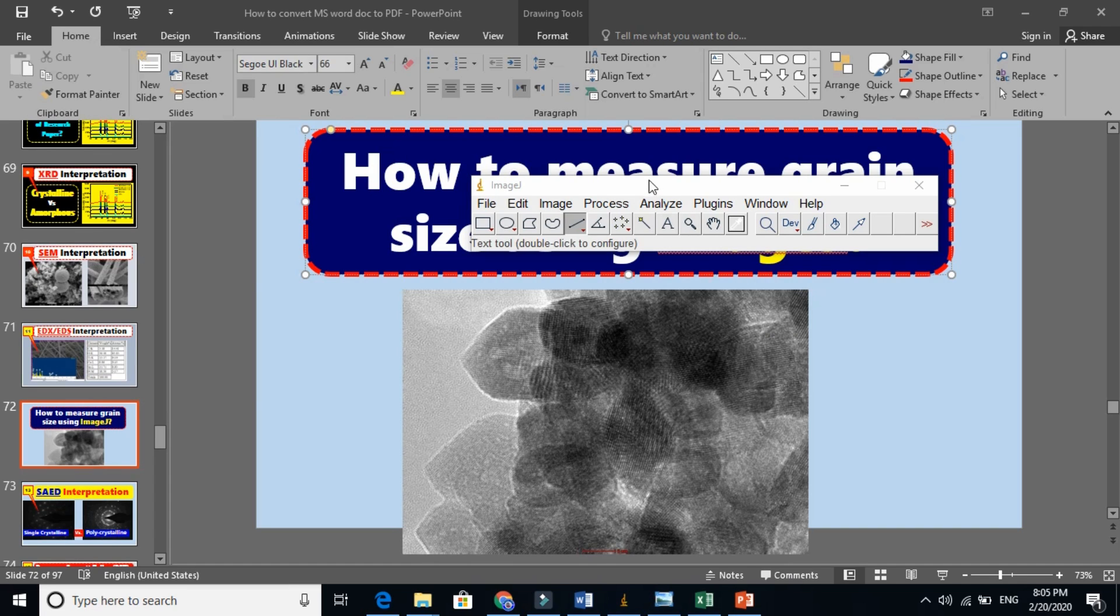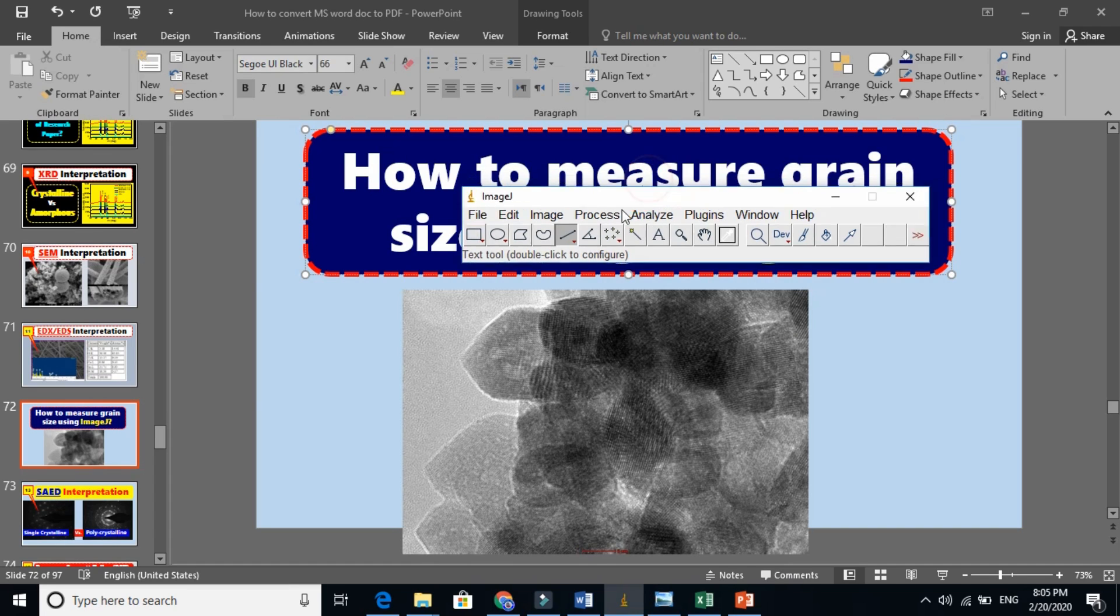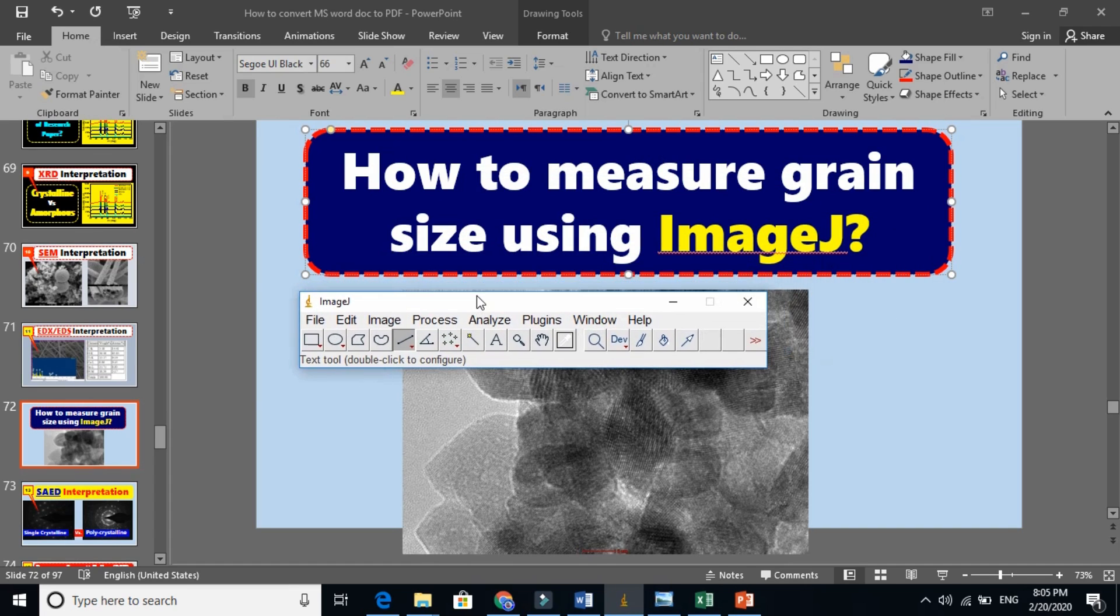In this video, I am going to show you how to measure size, grain size or particle size or crystallite size using ImageJ.